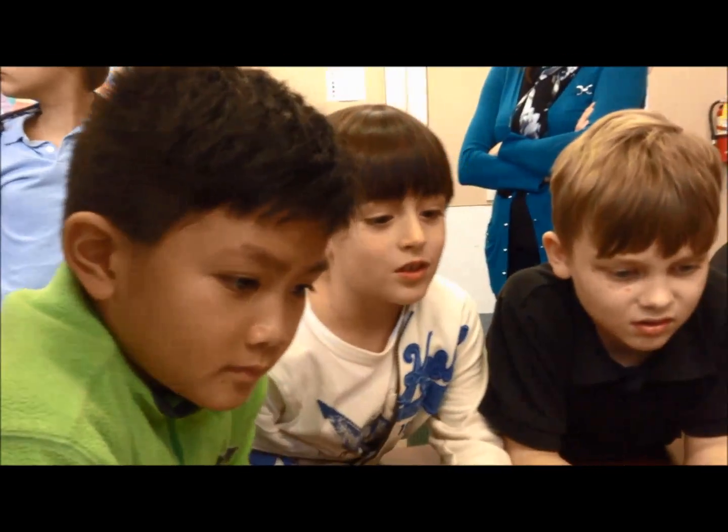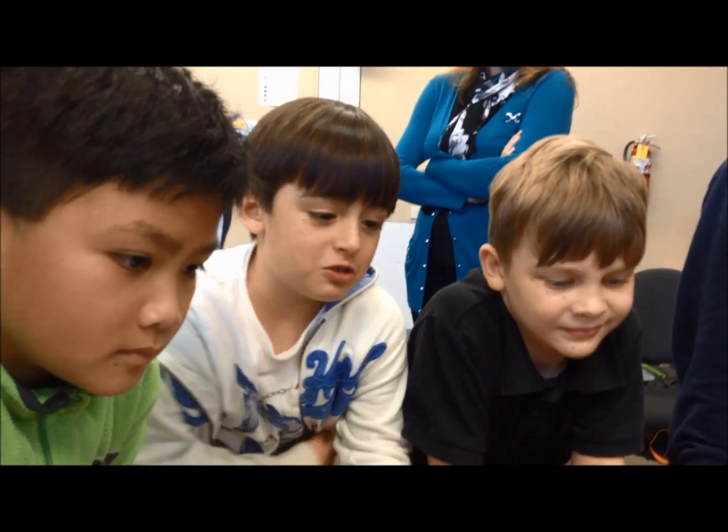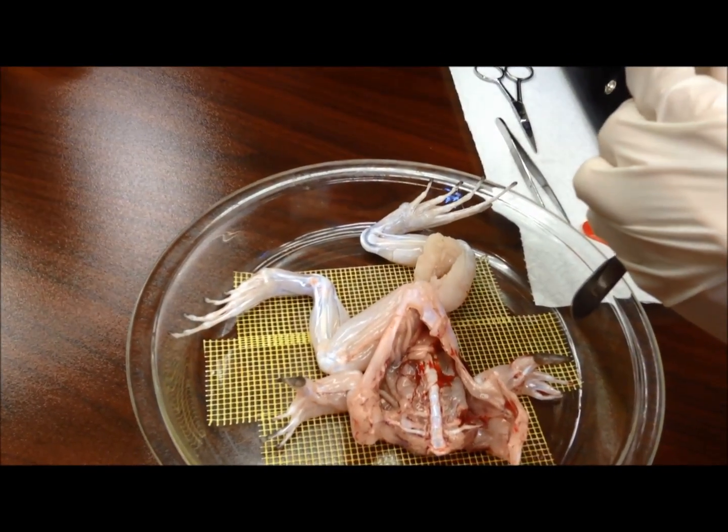Why does it need calcium to move? Can any of you guys answer it? Because it's part of its energy. Oh guys, oh god — it's twitching! It's moving, it's moving, it's alive!